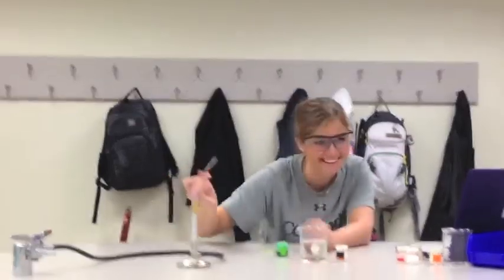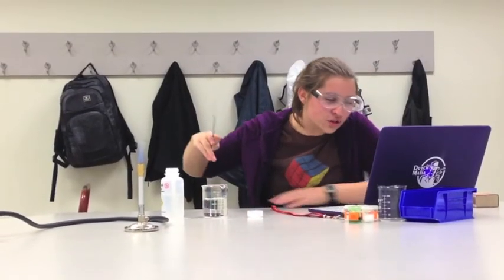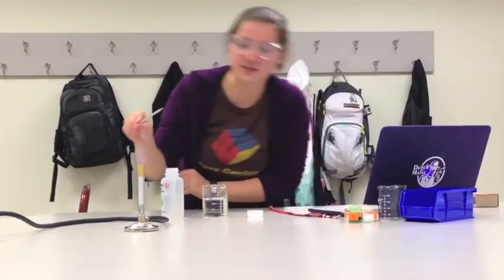You take it out of the distilled water and you hold it over the flame until the water is gone and it starts cooling.